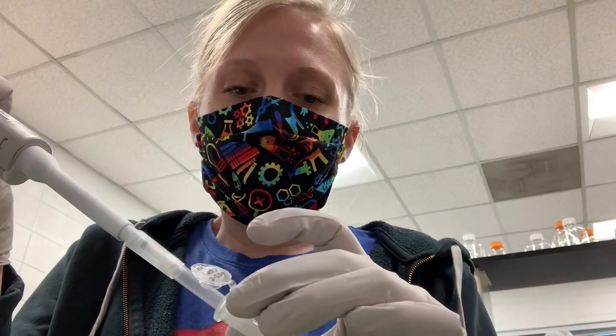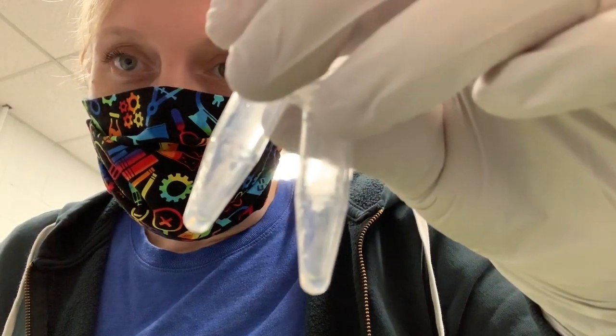And then use a smaller pipette tip to try to get all of the liquid out. So I've done 2 of these. You can see I've gotten almost all the liquid out. I'm going to do that for the rest of these tubes.